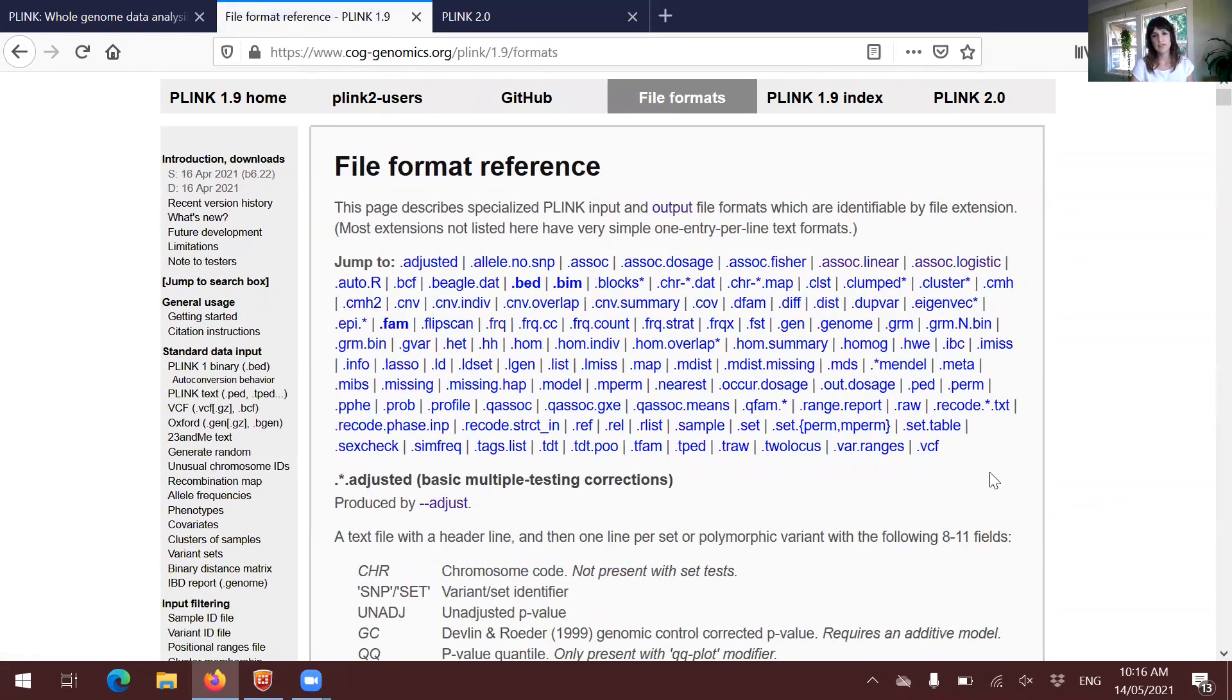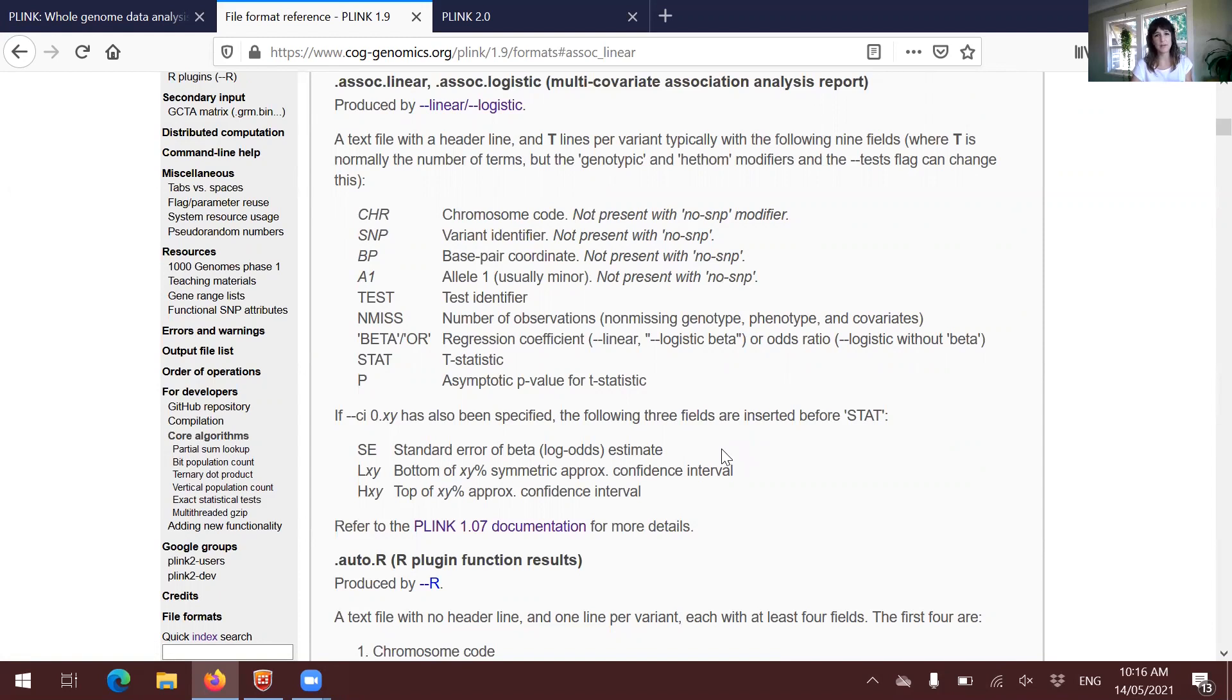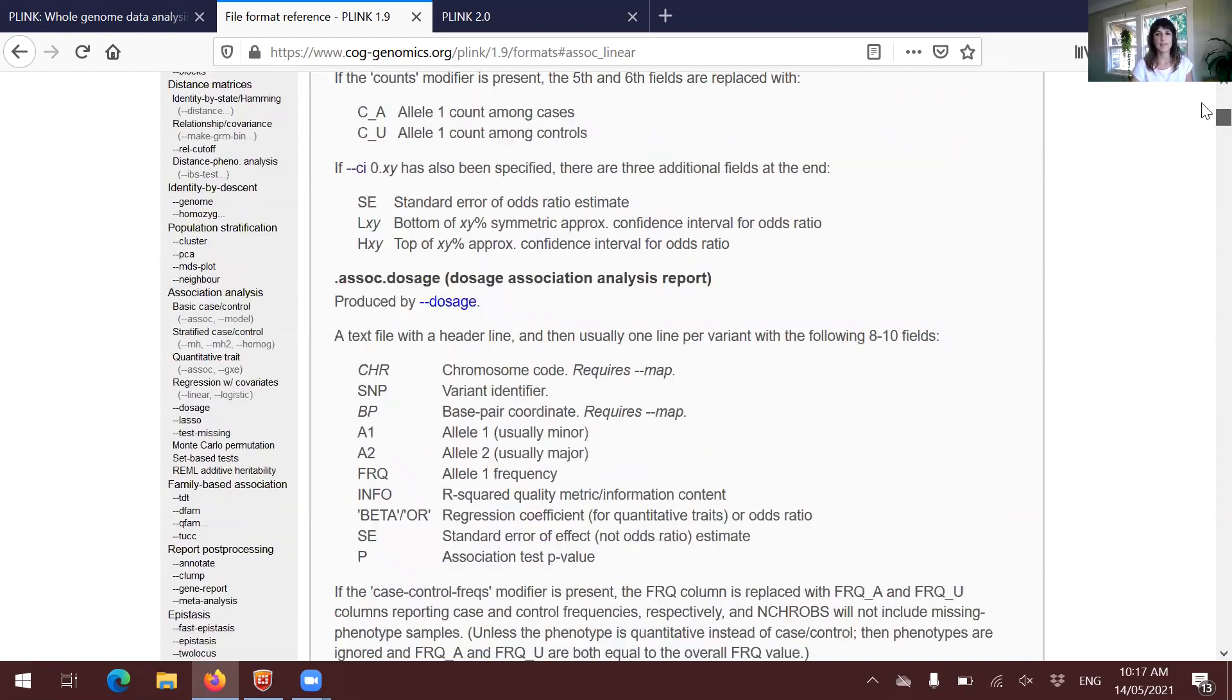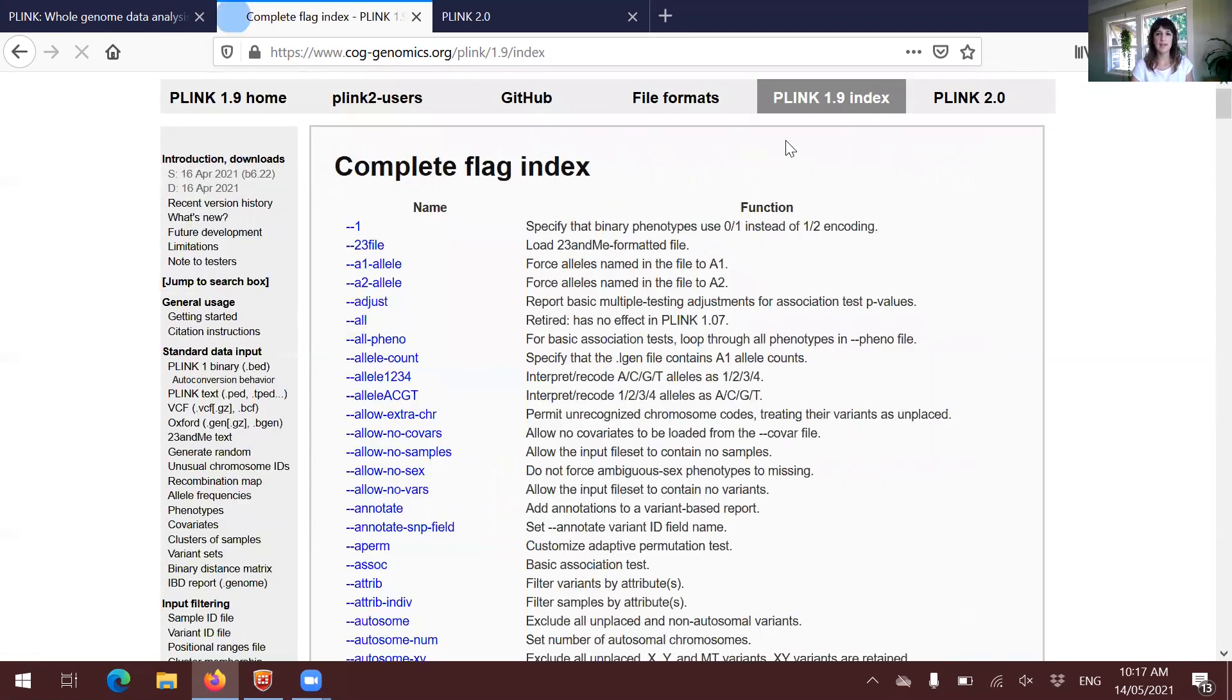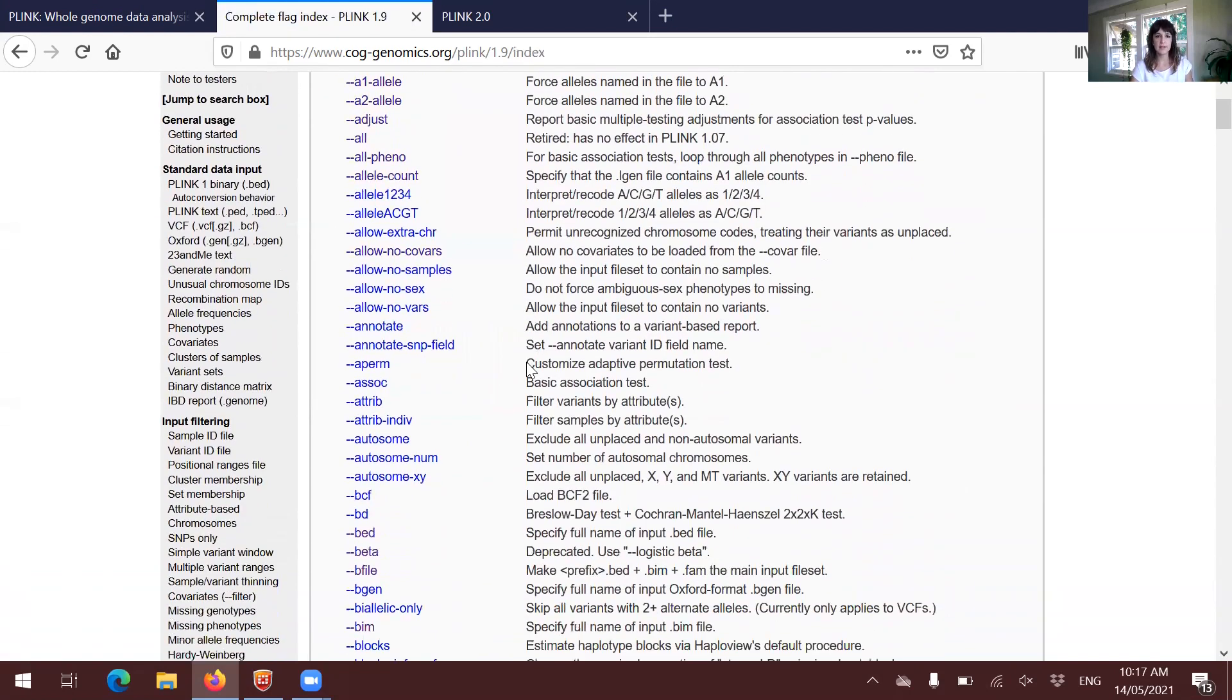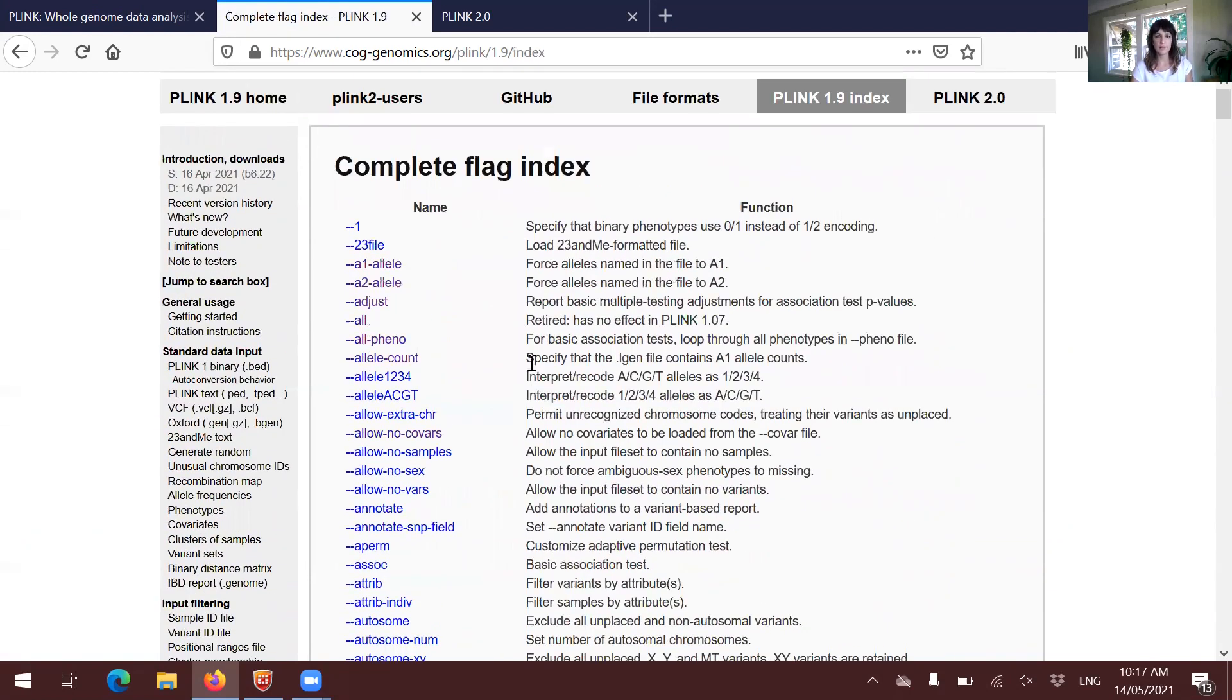You will be always checking the file formats because they will tell you what the contents are, what the columns mean specifically, and this is something to have into account because different programs will be giving you different outputs. It also includes a list of all the flags that you can think of.